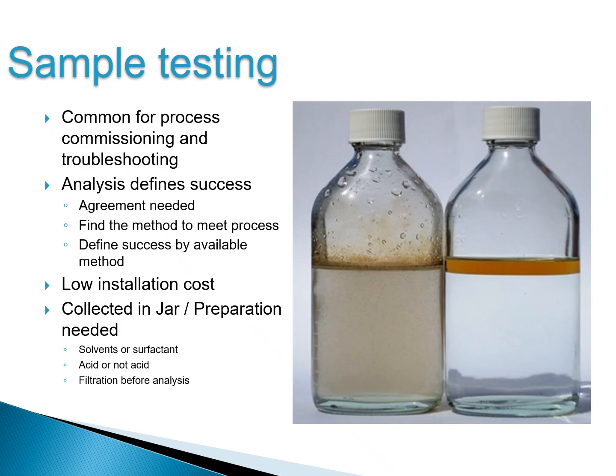To know how much oil, or what type of oil, or the nature of the oil that's in one of these water samples, some type of oily water analysis is needed. The method used to analyze it can be manipulated to tell you a little bit of what the nature of the oil is. If we look at the picture that we've got here, sample analysis is very, very common. There are a lot of different technologies and different ways of handling it.